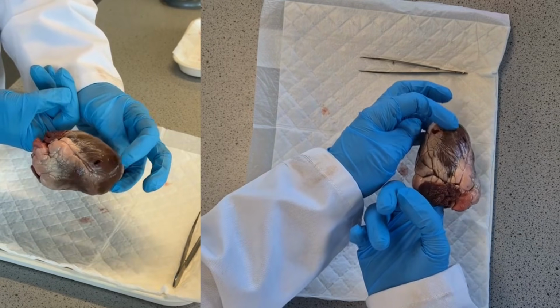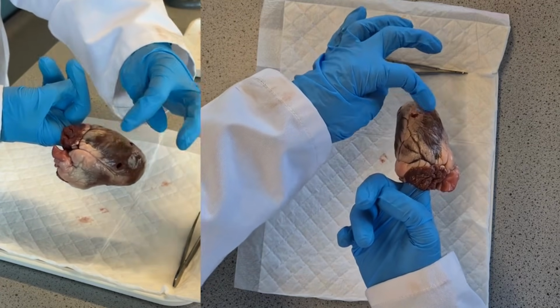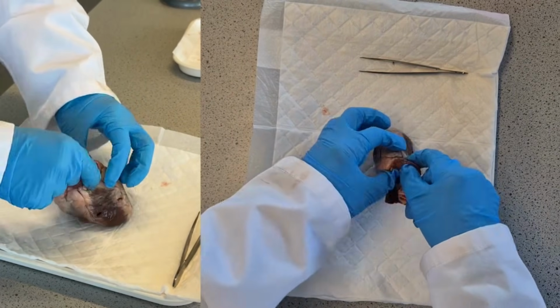So my finger is now down here in the ventricle. So I know that if I cut where I've got my finger, I will take my finger out, but where you cut there, you know that's going to go through the atria and into the ventricles. We'll then be able to open it and see at that point. So that would be what I would do next.